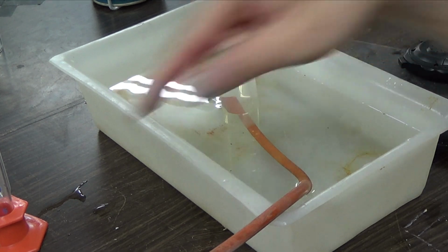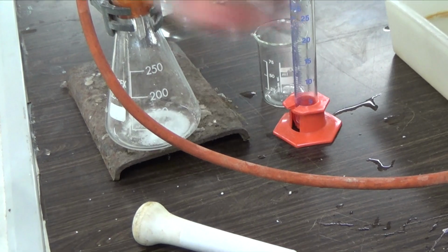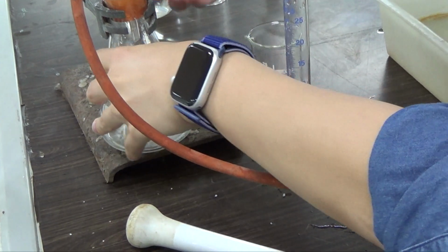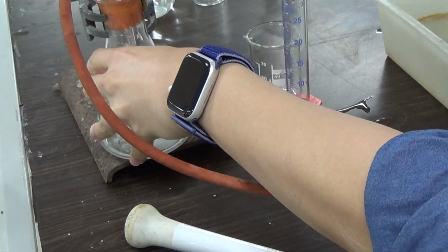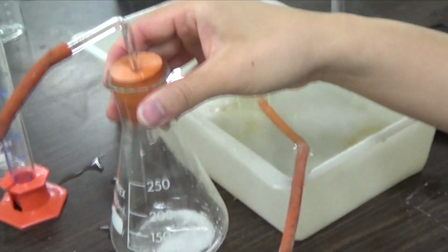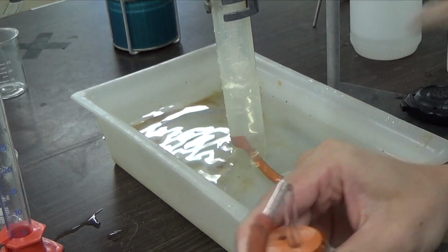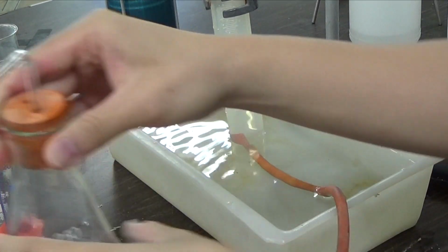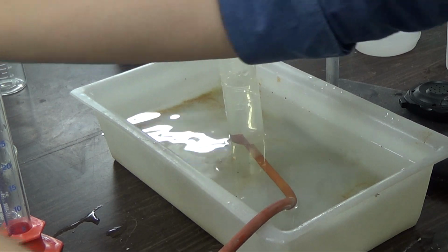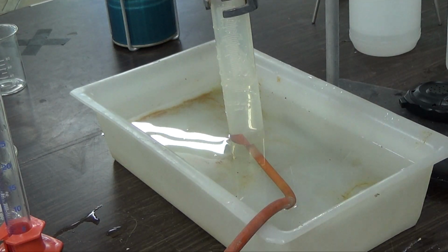What you could do is you should swirl the conical flask. Swirling means you give it a bit of a swirl, and then you will see what happened to the bubbling here in the measuring cylinder. So if I give it a bit of a swirl, you can see the bubbling is a lot faster because you're actually ensuring that all the solids are exposed to as much of the acid as possible.